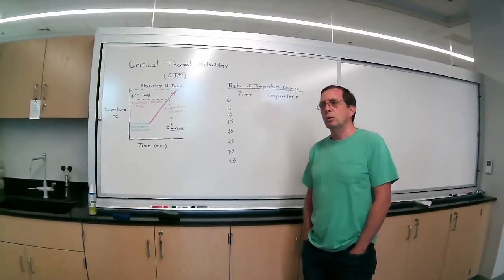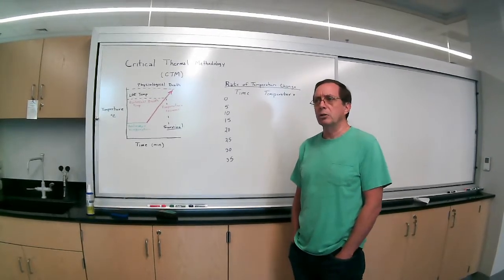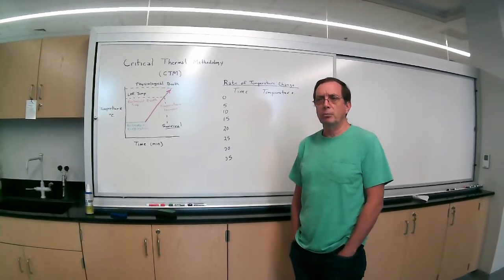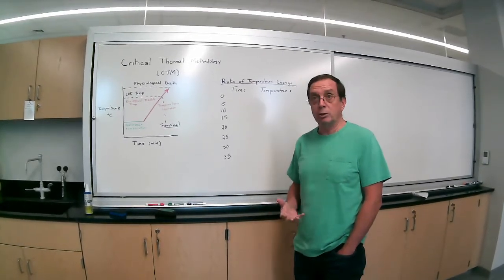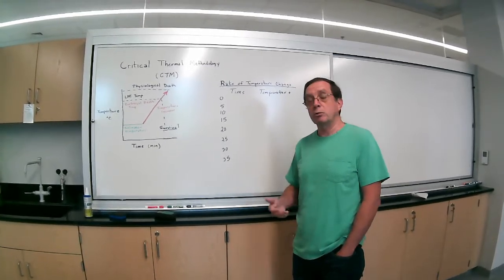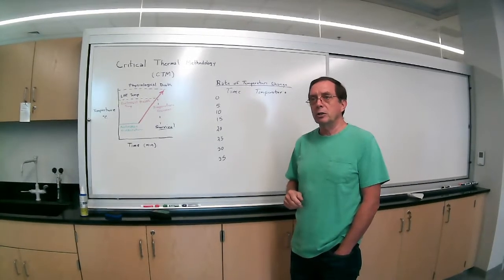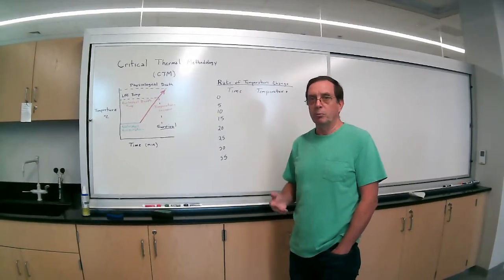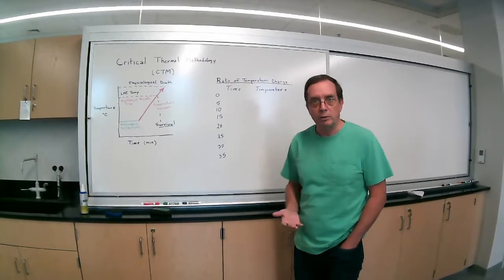And so what we're going to do today is begin by looking at goldfish that have been kept at room temperature for several days. So they've acclimated to the temperature regimens they've been exposed to, partly in the pet store and partly up in the lab. And then we're going to calculate the critical thermal maximum number for the population of fish based on the individual responses.